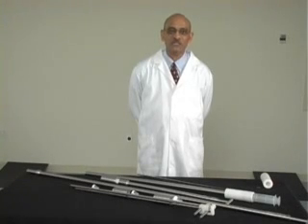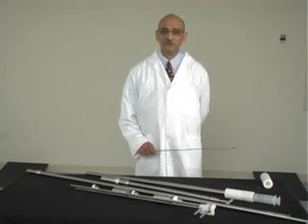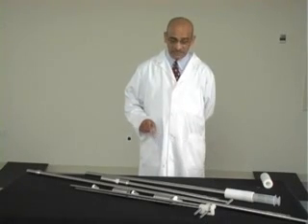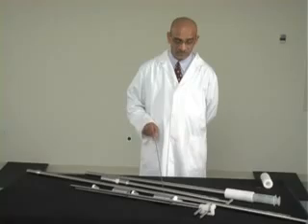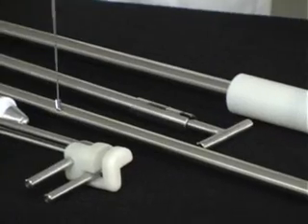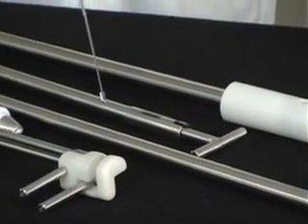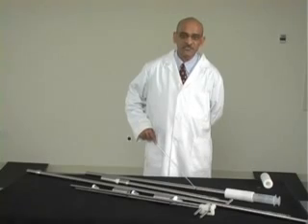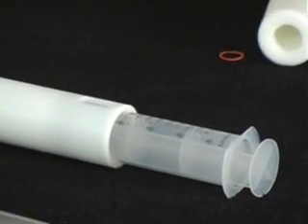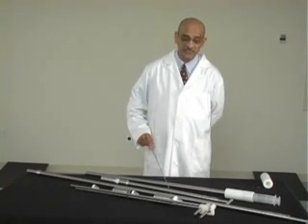Let me introduce Globe Pharma's liquid sampler line to you. There are four different models of liquid samplers from Globe Pharma. This is model 7, multi-cup liquid sampler. This is model 8, syringe sampler. This is model 9, a single cup bulk sampler. And this is model 16, syringe type sampler, but it is different from model 8 syringe sampler. I will show the differences in a little bit.